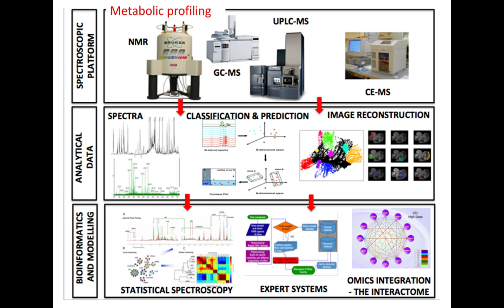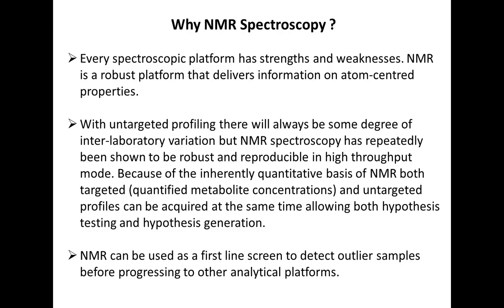So the idea, as you'll have learned from Manfred and Claudio, is very much that we measure biological samples, we sort of fingerprint them, and then we perform some sort of modeling on them to look for either diagnostic or prognostic information about different diseases, and we can take the biomarkers and model them using various tools. But the part we're focusing on today is the spectroscopy.